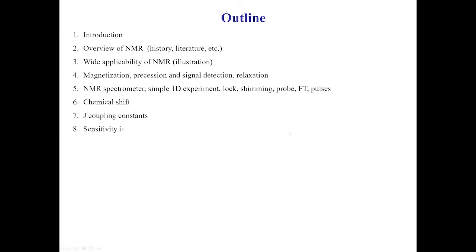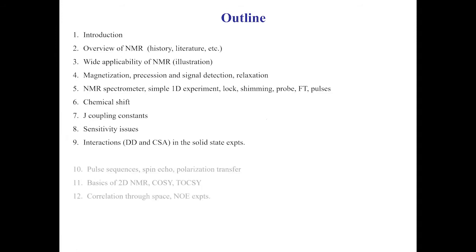Right, yes. So today's talk is 45 minutes. I'll introduce, or I did that a little bit. I'll give a short overview of what NMR stands for, nuclear magnetic resonance. I'll illustrate a little bit through a few snapshots what we can all do. It's in no way complete because we could talk for a day about that. Then I introduce terms, magnetization down to signal detection and so on.